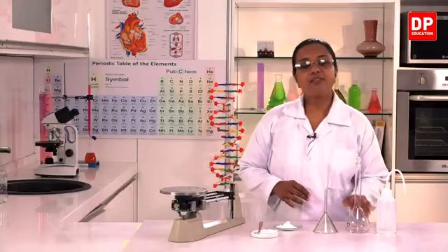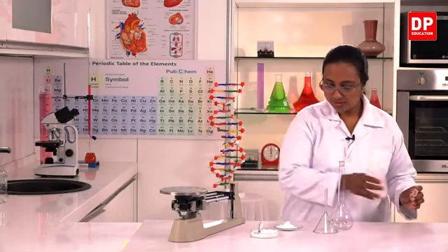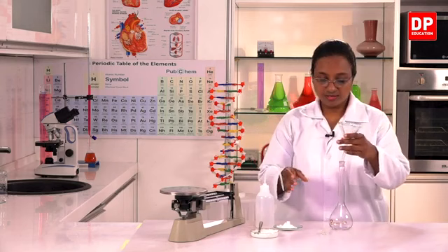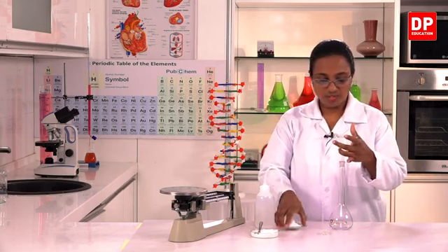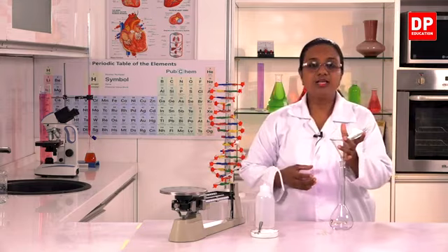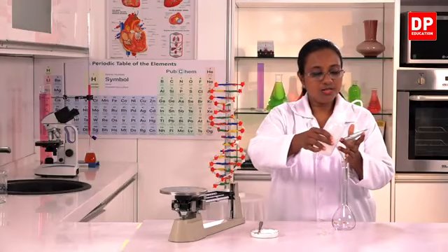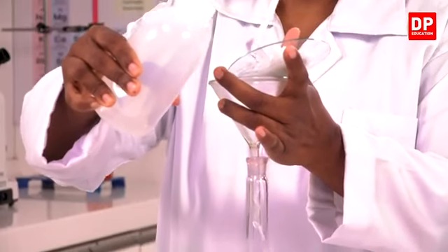So now I have the volumetric flask, a clean one. I will set everything so that I can easily transfer the substance. So here I have the funnel. I'll hold it slightly above the mouth of the volumetric flask, and I have to hold the solute containing watch glass in this manner, so that I can easily dissolve and transfer all the sodium chloride into the volumetric flask.